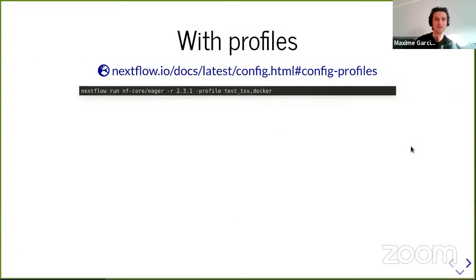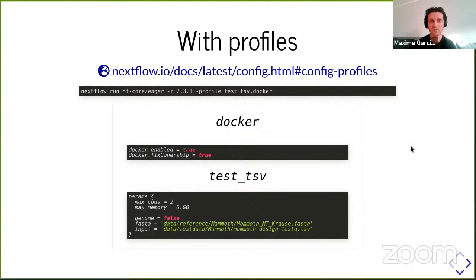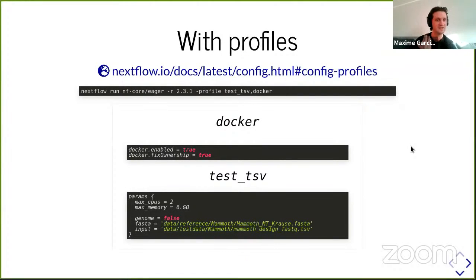The whole beauty about Nextflow is I can also use profiles to do the same thing. I can still have a look at the docs to see how it works. But basically, profiles are like aliases for configs. So here I'm using two profiles at once: a test TSV profile and a Docker profile. The Docker profile will get all the information for Docker. The test TSV profile will provide information for a small computer and also provide information for the input file and the reference genome. This profile is actually used very frequently, and since I don't want to type that all the time, it's in the config file.